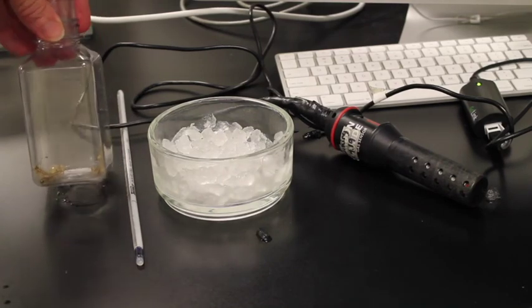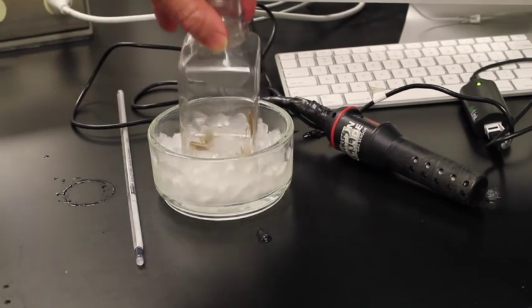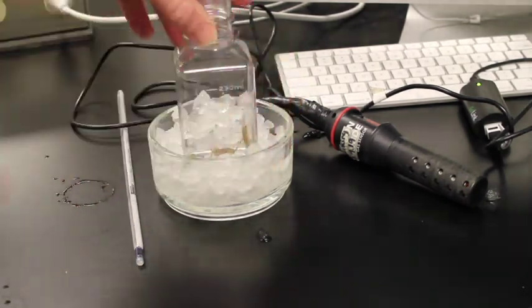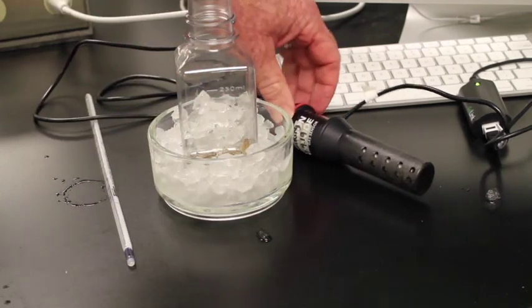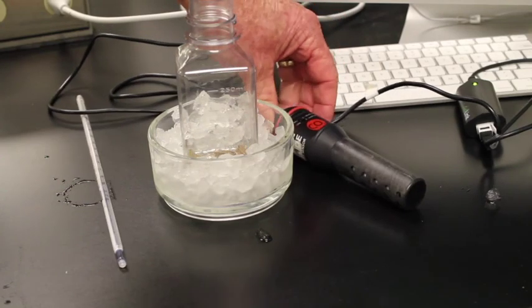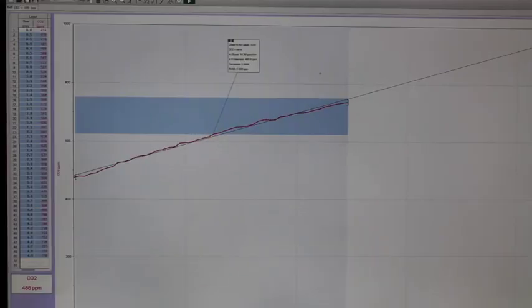Here are the crickets. We now want to cool them off, so we can put them on ice. So wrap this around, get them all in there. And we're going to give this 5 minutes to wait. Then in 5 minutes we'll add the CO2 probe to it, and we'll go ahead and start it on the computer again. Okay, now we are ready to do our next trial.